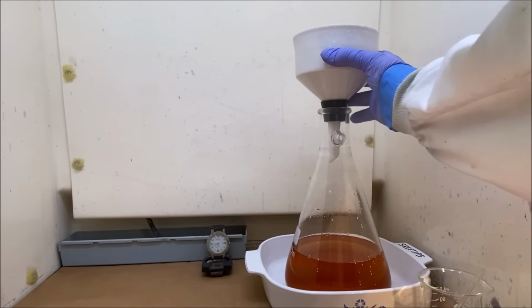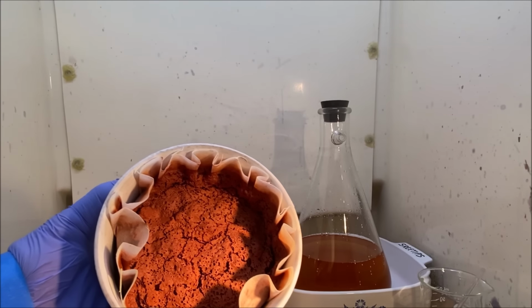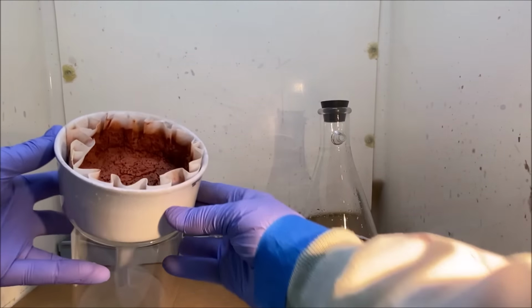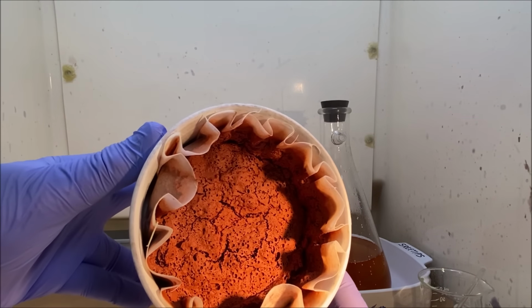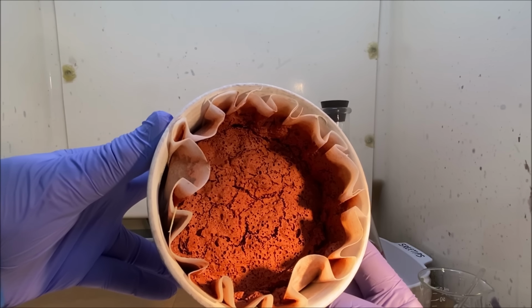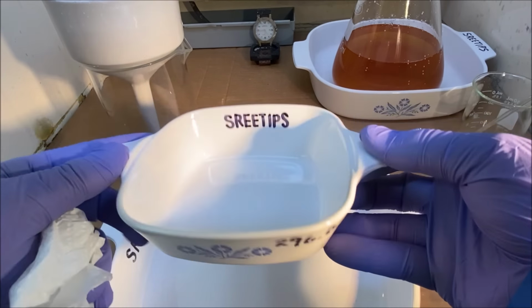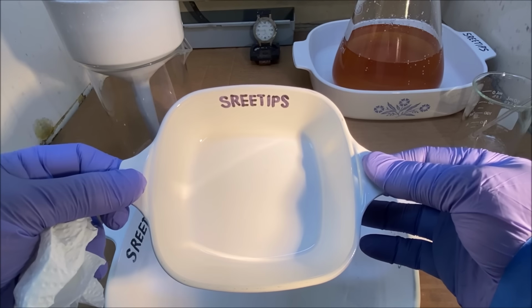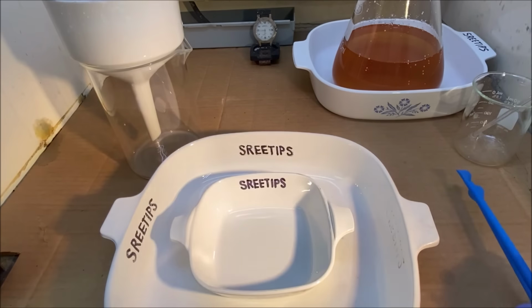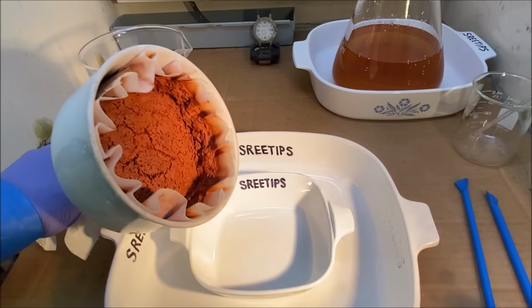Let's get our platinum. This is what it looks like. Hexachloroplatinate. Got a casserole dish here. It's got the weight on it, empty. And what I'll do is transfer the platinum into this dish now.